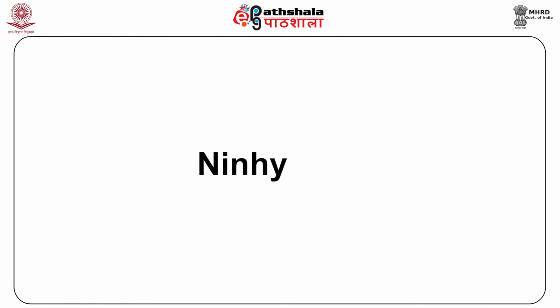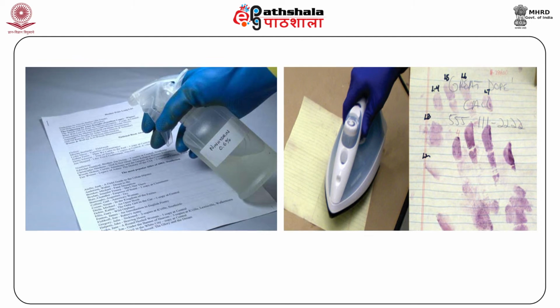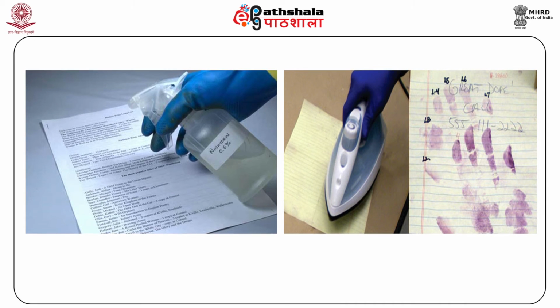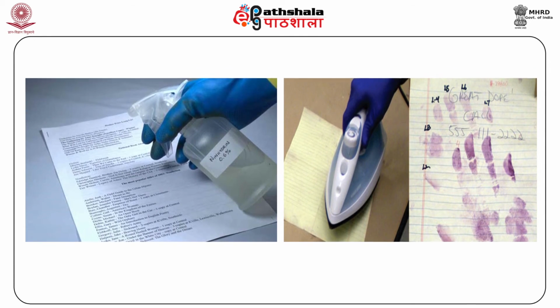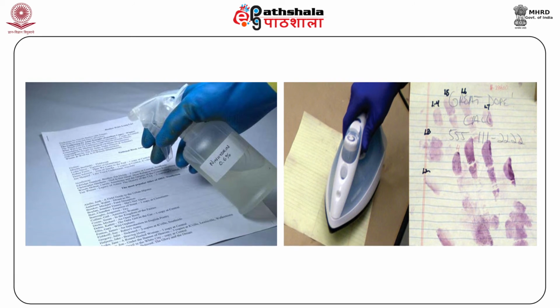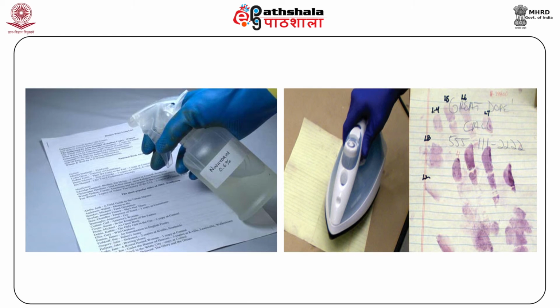Another reagent is ninhydrin. The ninhydrin technique has traditionally been the most popular one for processing latent fingerprints on porous, absorbent surfaces like paper, cardboard, and wood.